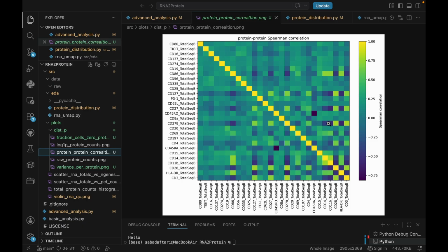But we also have very yellow colors here and here. So it's kind of a mix. Yeah, but this is very interesting. It's too dark to not notice. And so I'm guessing these two proteins are going to be mutually exclusive. So it's going to be one or the other.